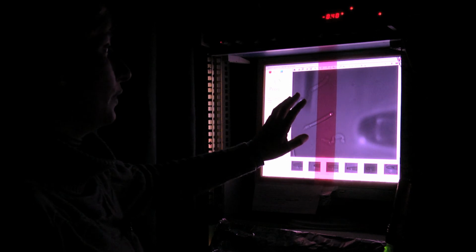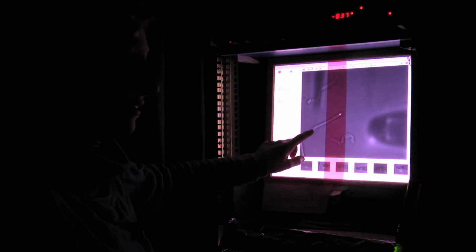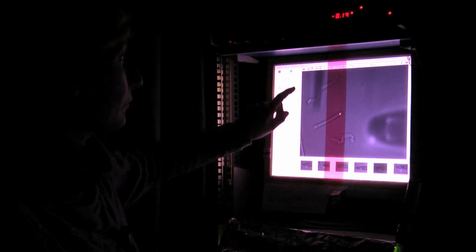We have to draw inside the glass pipette the inner segment of the cell. After this procedure, we have to move the cell near the optical fiber. Then we stimulate first of all the rod with diffuse light, and we observe this kind of response.